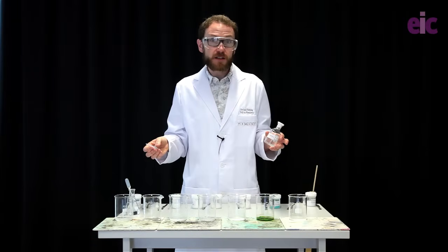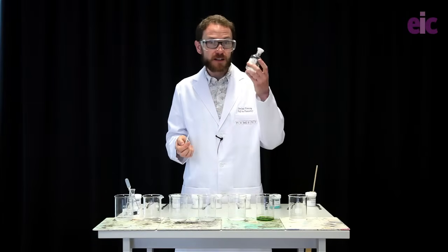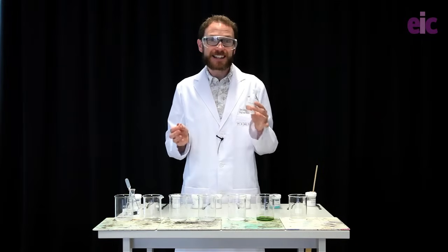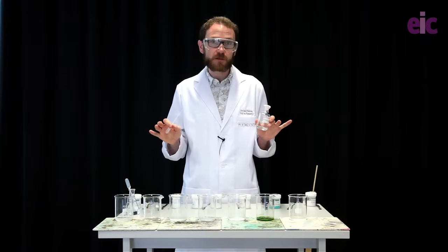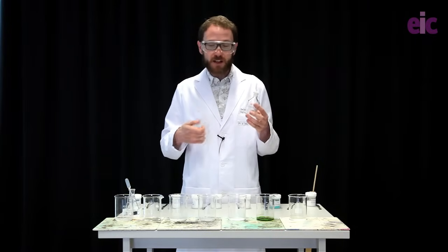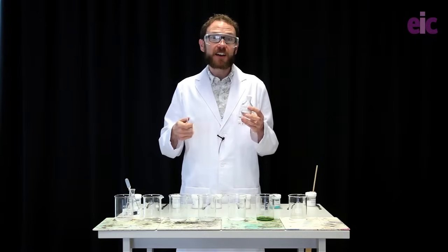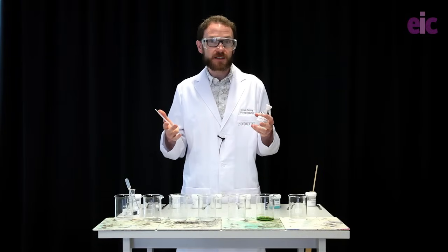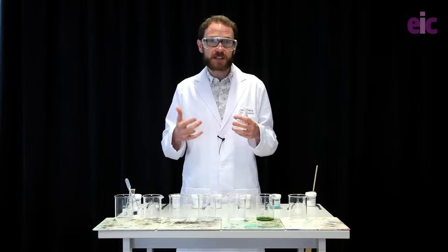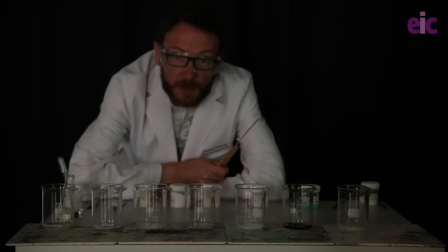Now I've got my beakers all loaded up with solvent. The next thing to do is to make sure I remove the solvent bottle at least three meters away from where the demonstration is taking place. I'm going to completely remove the bottle and at the same time darken the room so we can enjoy this experiment in the best possible conditions. Lights are down. I've got a meter rule with a splint attached. My audience are three meters away. I'm going to use the meter rule to light these up. Let's enjoy the rainbow flames.